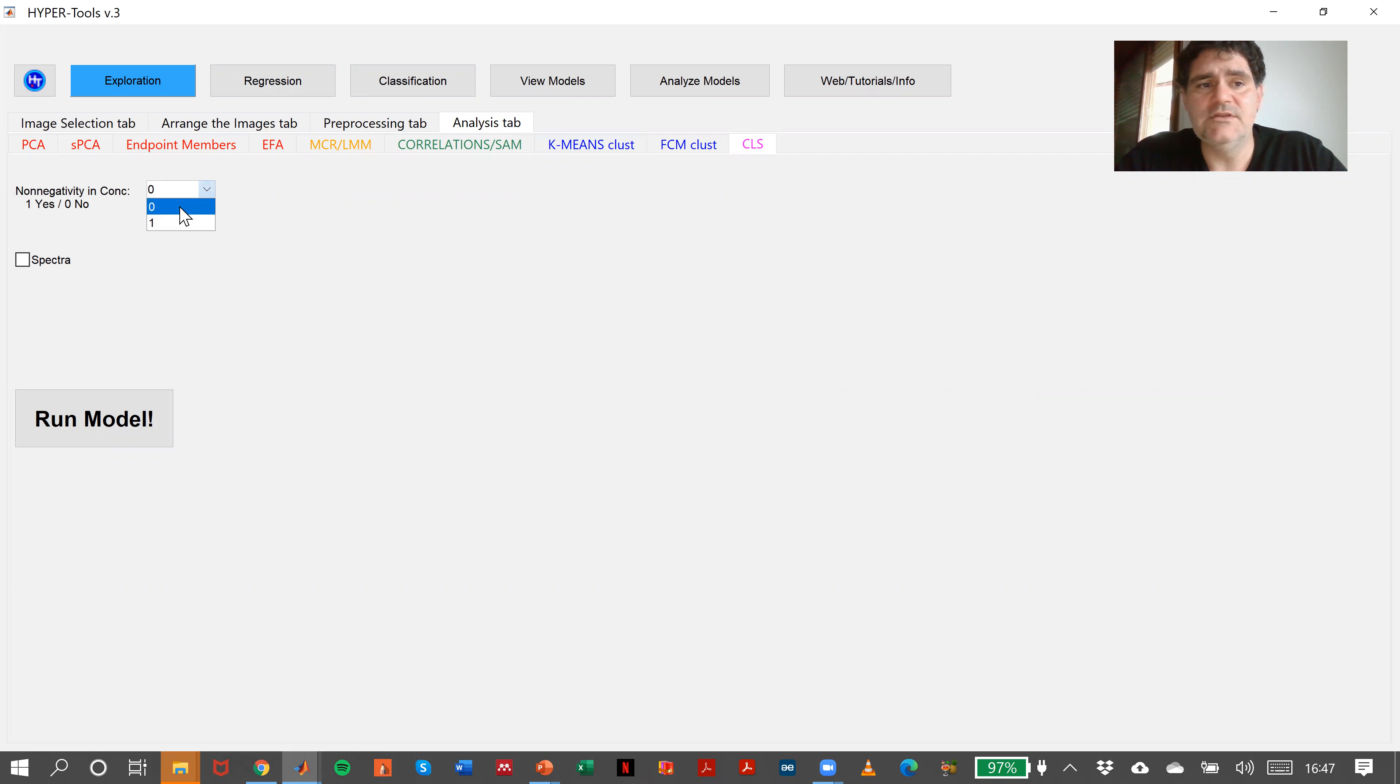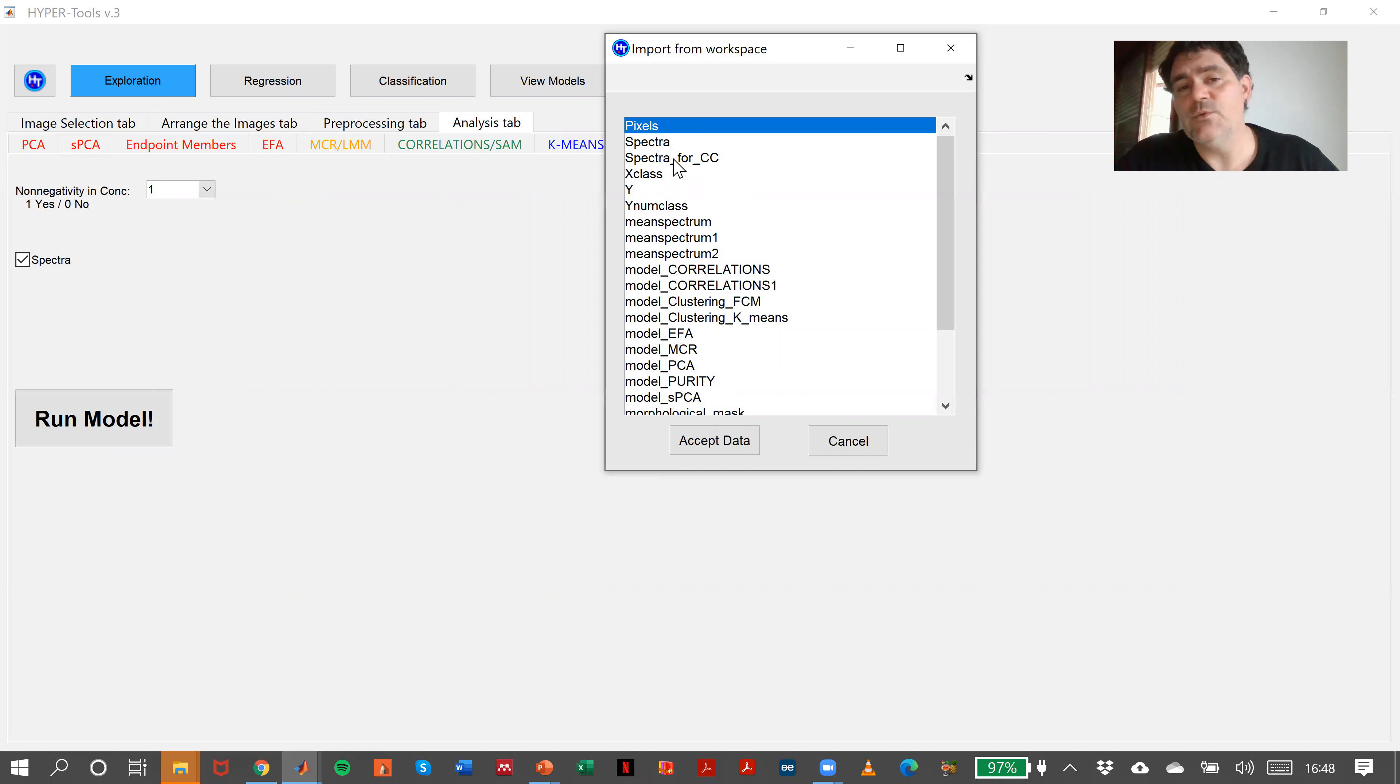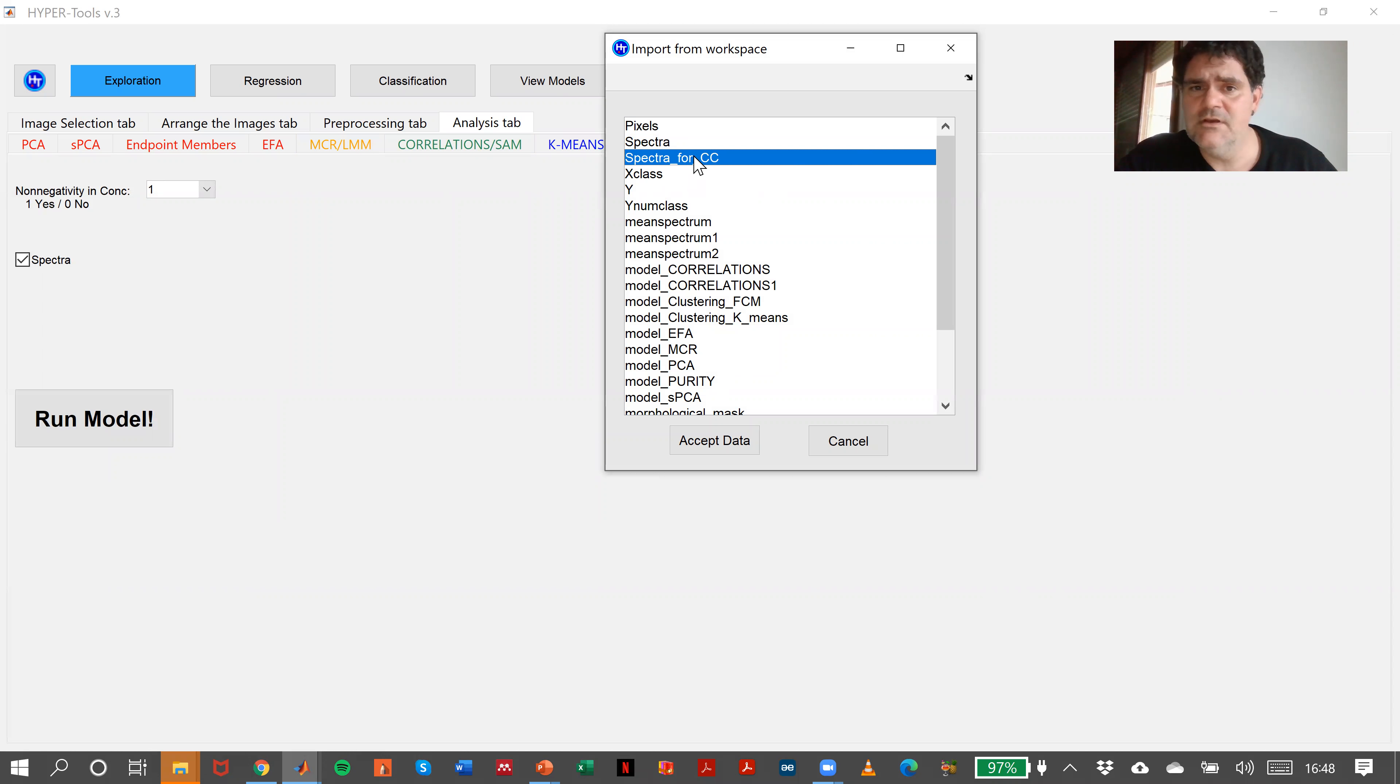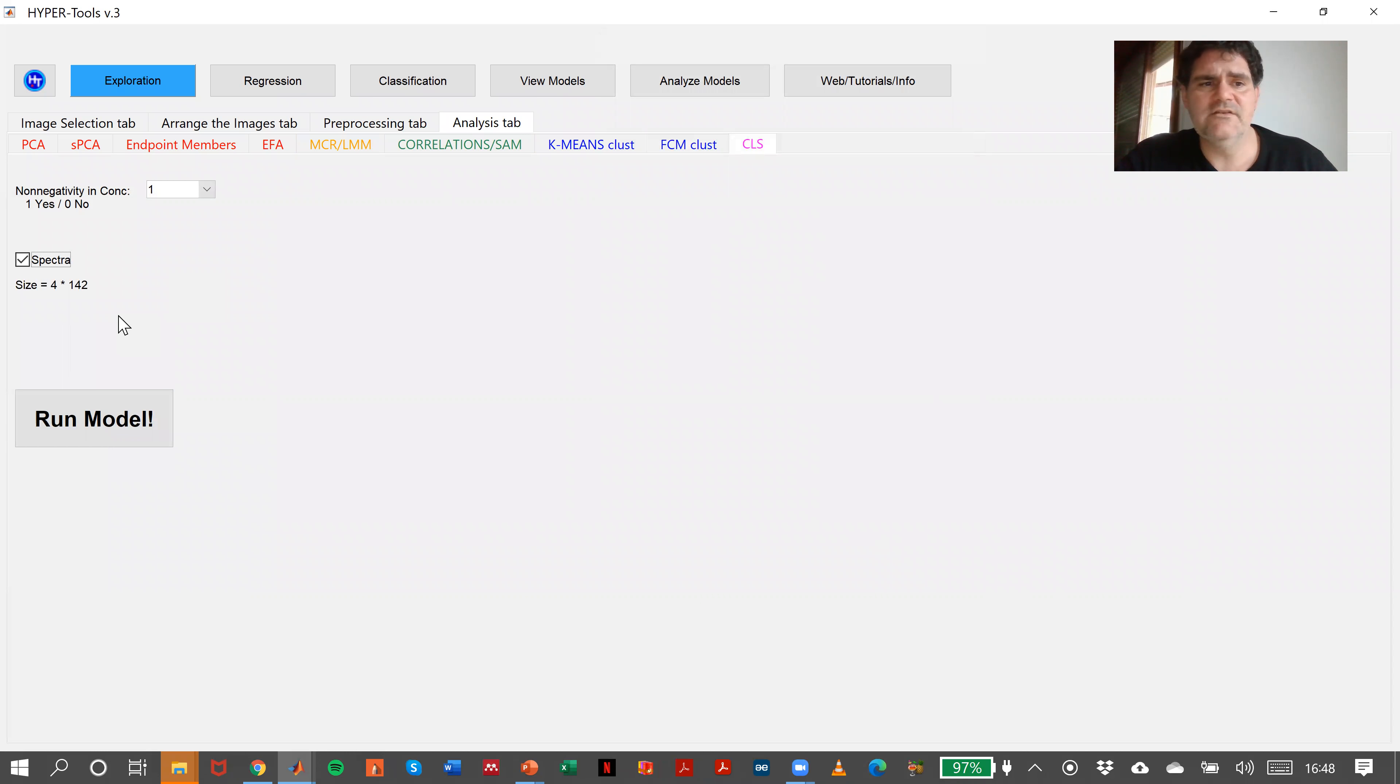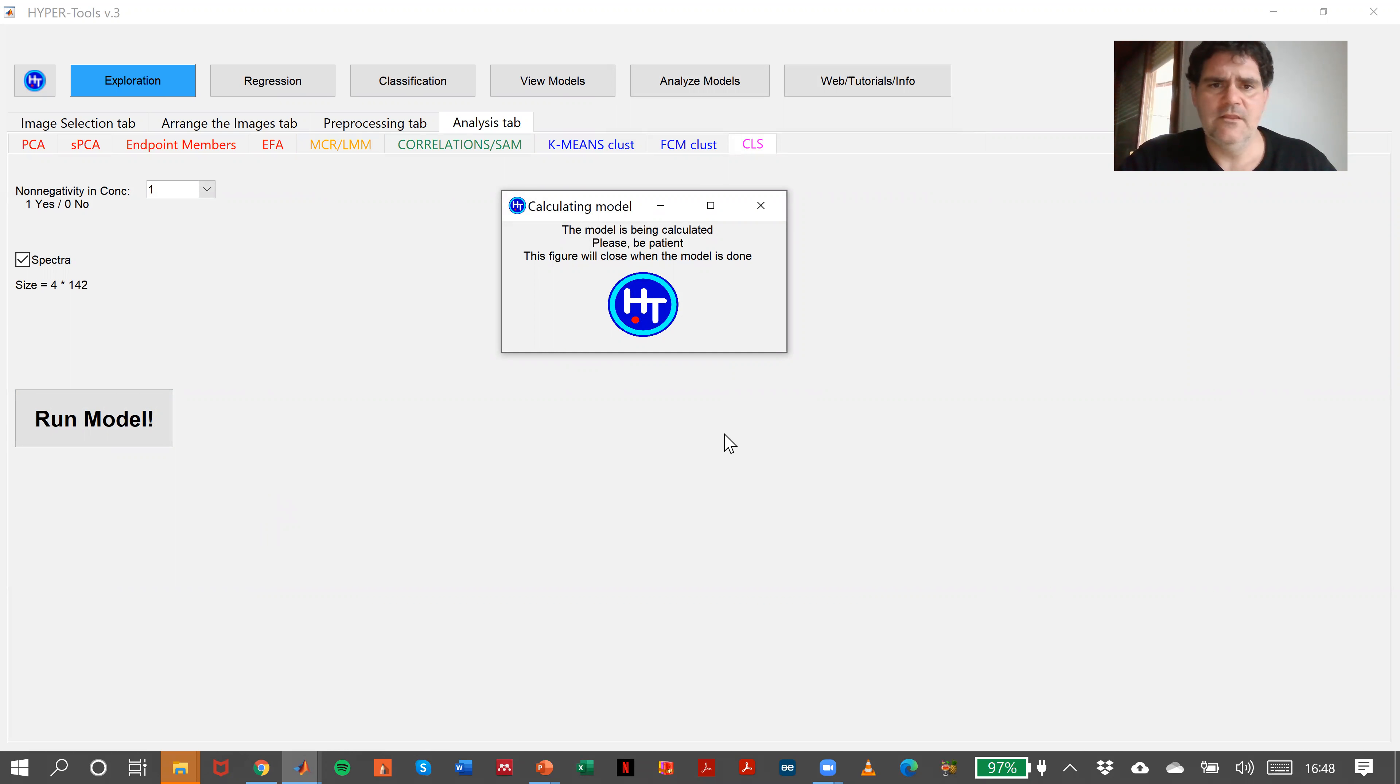Finally, the last thing we can do in exploration is classical least squares with no negativity in the concentrations. For the spectra, we need to load the database in our workspace. In this case, we'll use the same database as we used for correlations. Spectrum, accept, and run the model.